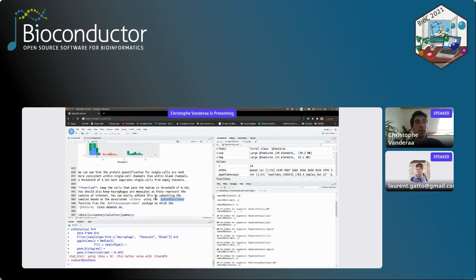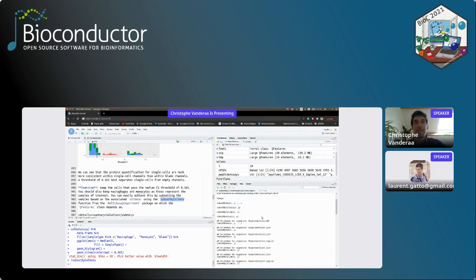Did I provide the hints? No, I did not provide the hints. So maybe I can give a small hint. The hint is, the Y should be a vector of logical values. Okay, this true, this true, I want to keep it. False, I don't want to keep it. True, I want to keep it. False, I don't want to keep it. And so on, for every entry in the colData.